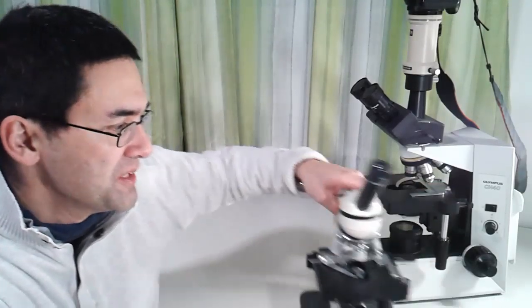Well, I have to admit the answer is not quite that easy because it depends on several factors. And I'd like to give you now more or less a complete answer concerning this. First of all, what magnification do you need to see bacteria? Well, theoretically you can already see bacteria or most bacteria with a total magnification of 100X.